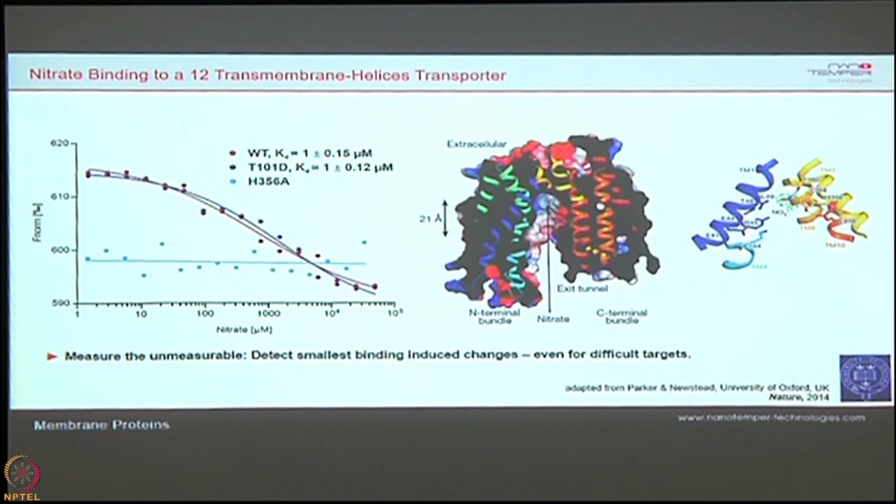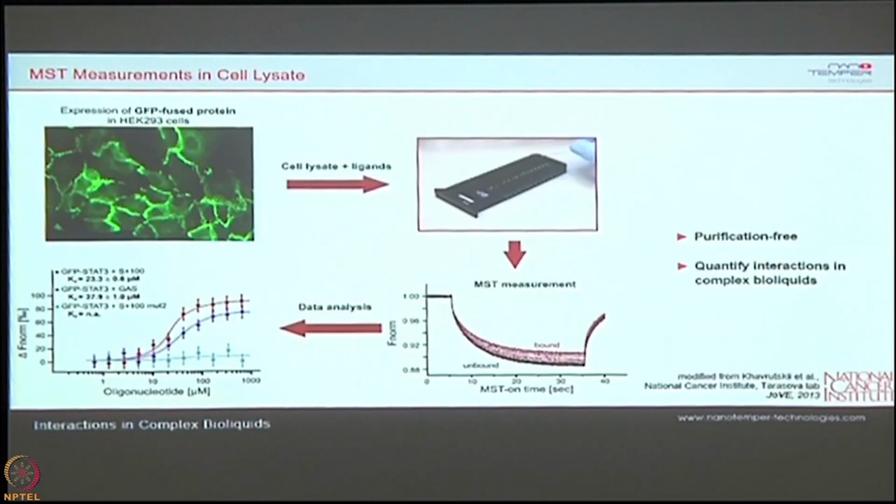So in this way, any variety of sample, it need not be a protein, any kind of molecular interaction, protein-carbohydrate, protein-ion, anything in between them can be studied using microscale thermophoresis.